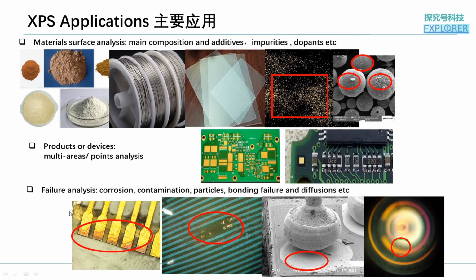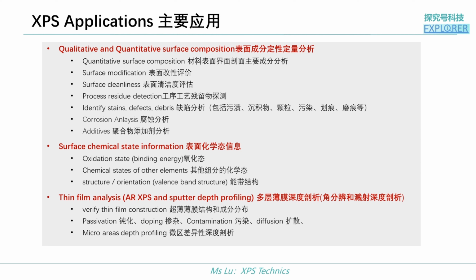It can also meet various failure analyses such as surface corrosion, surface contamination, bonding failure, and surface particles. So based on the above introduction, you can see XPS can handle both large area analysis and micro areas. It can meet different requirements or solve various problems in the materials field. Main application: surface analysis.